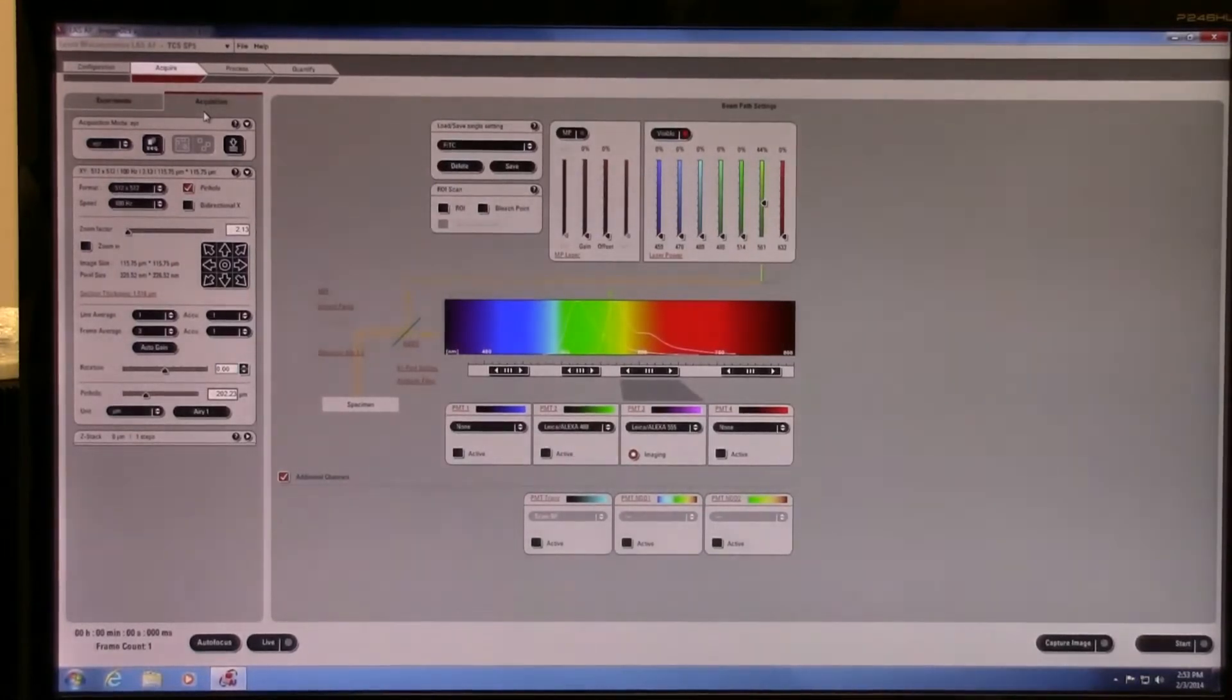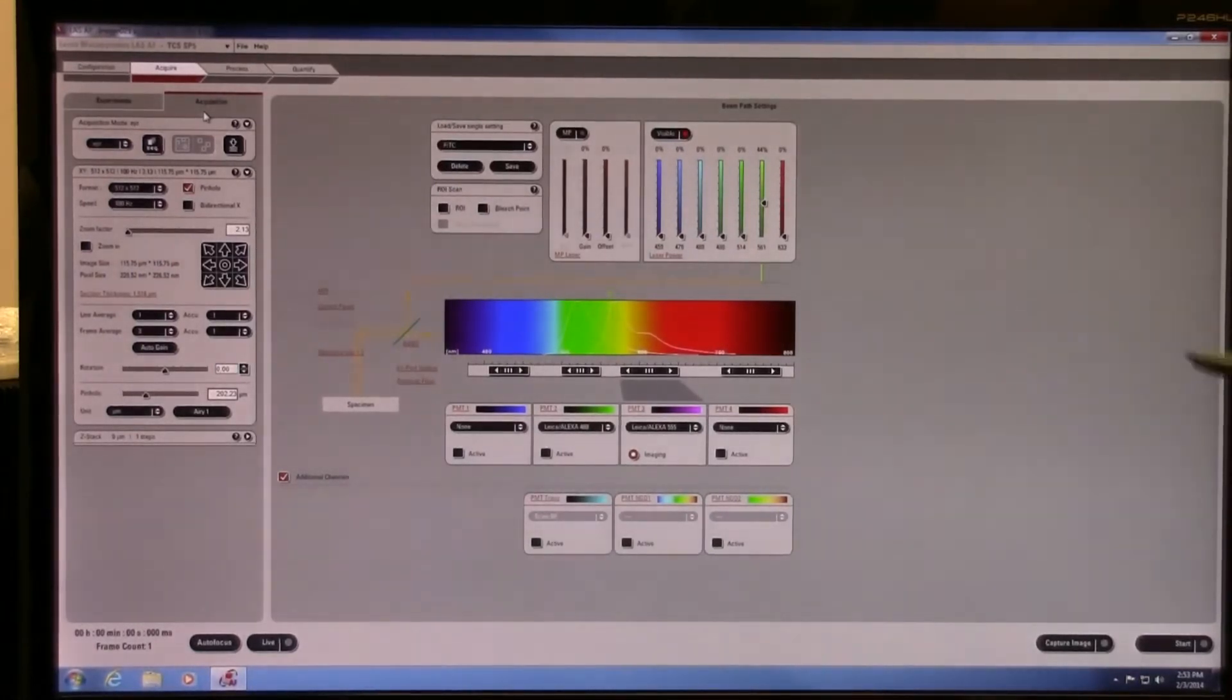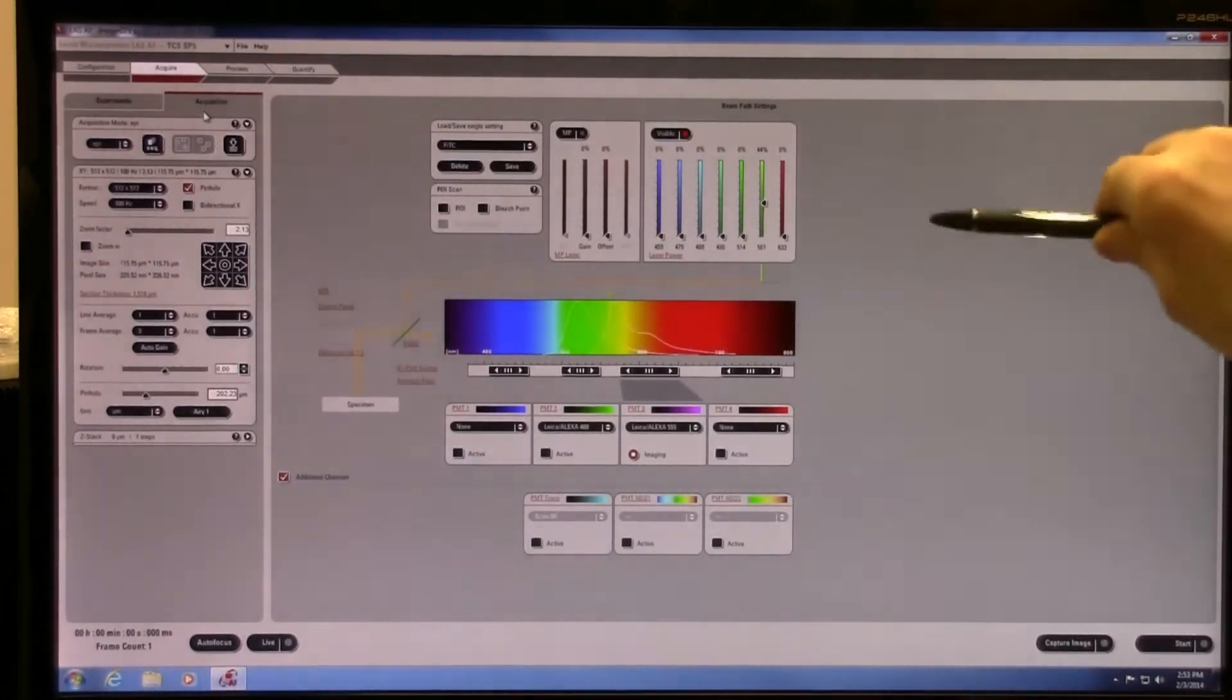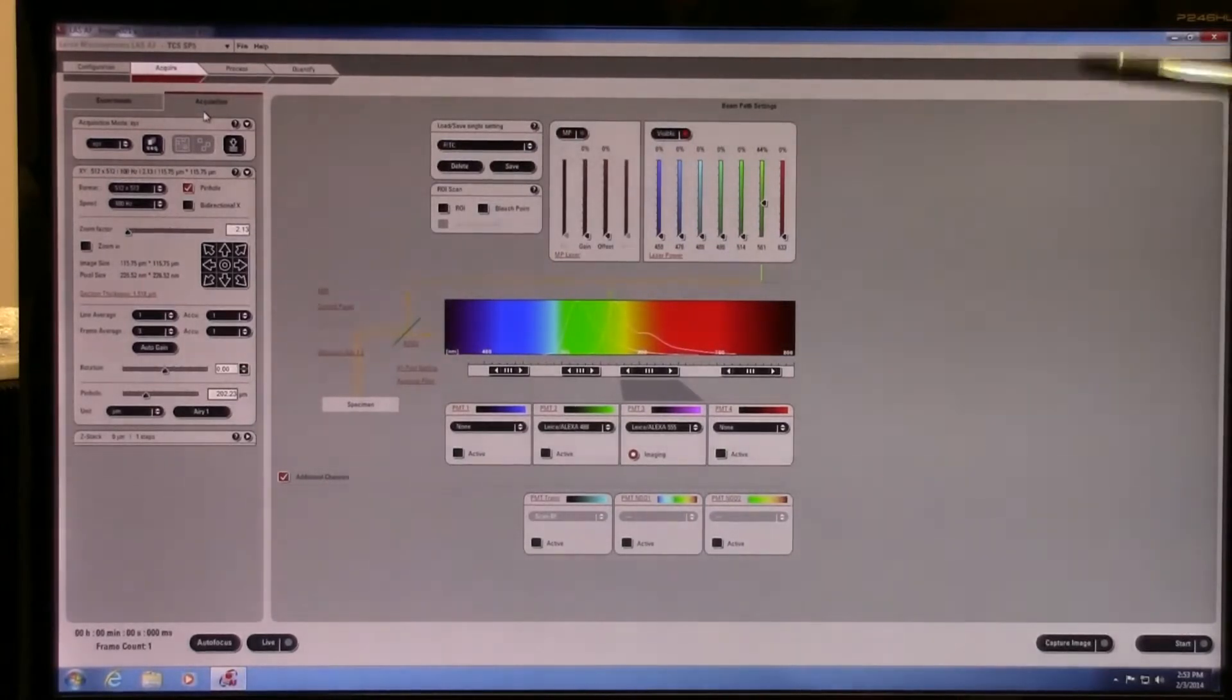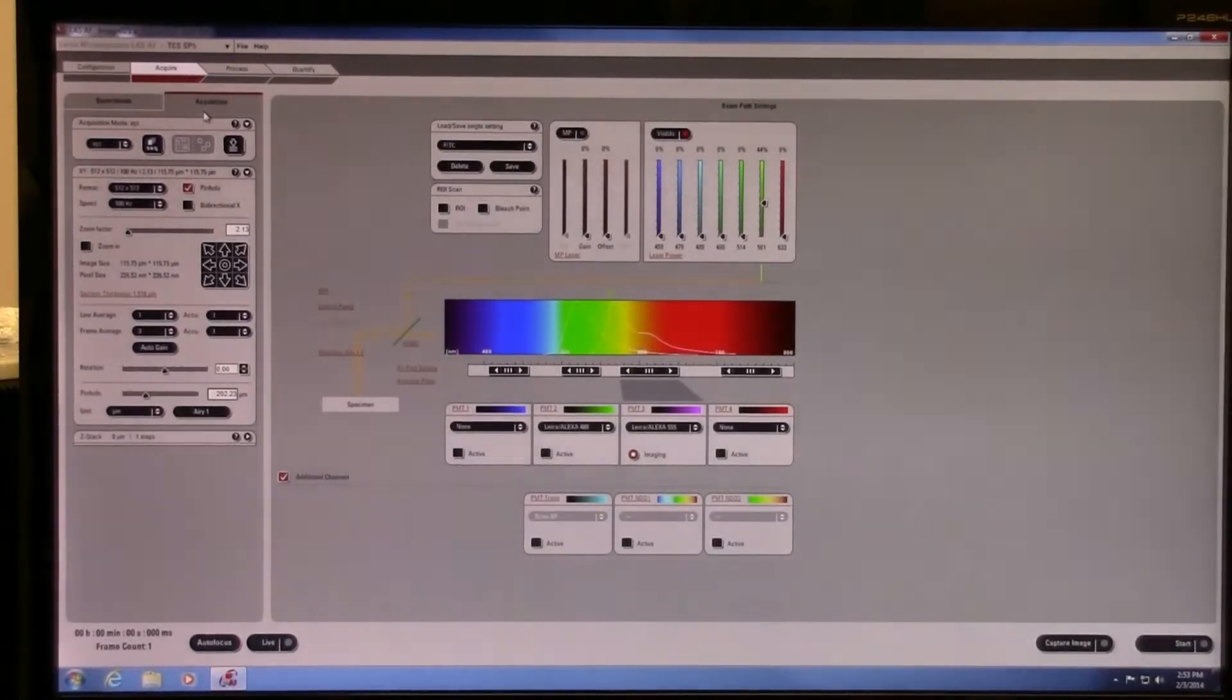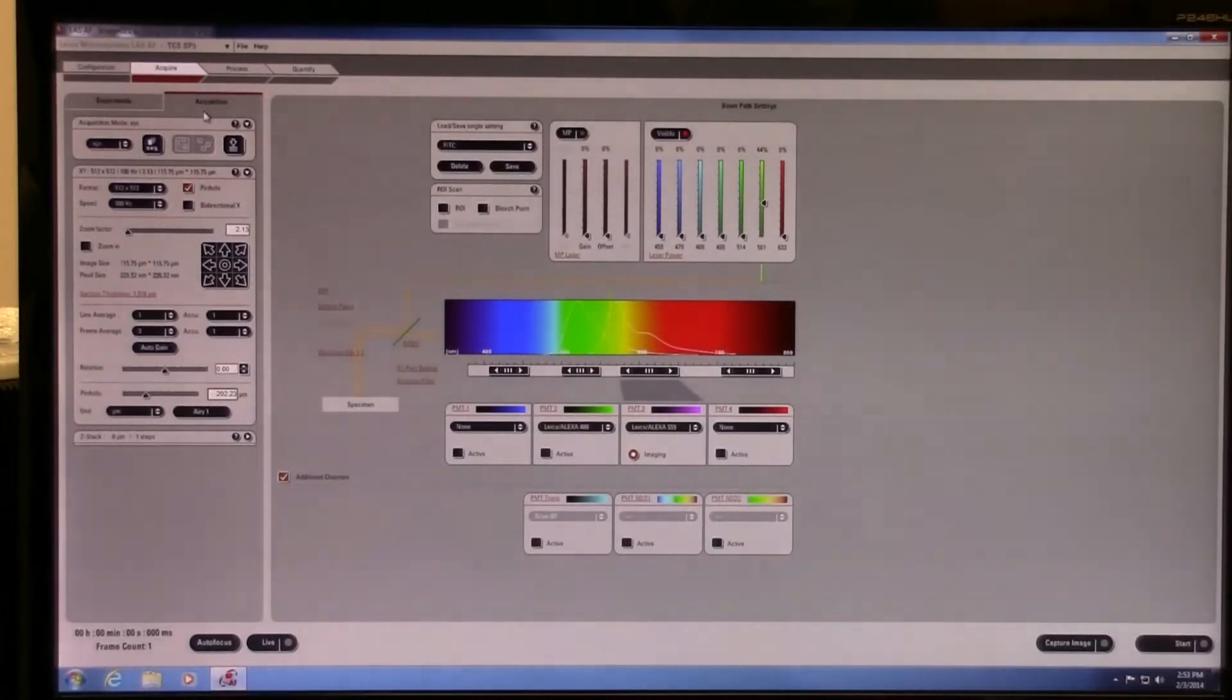I'm not going to go through the introduction and startup of the software. I'm going to just continue on from a base knowledge of the basic use of a single channel acquisition of the software.